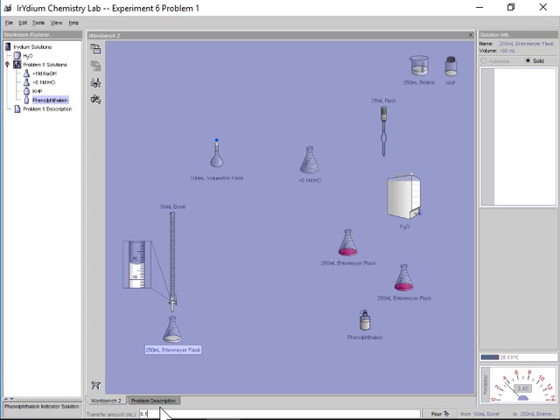changing color. Maybe I want to add in only 0.1 at a time. So I add in 0.1, I add in maybe once, twice, 3 times. Now I'm really, really close. Maybe I want to add in 0.05, right? This should change the color. Oh, there we go. And there we go.